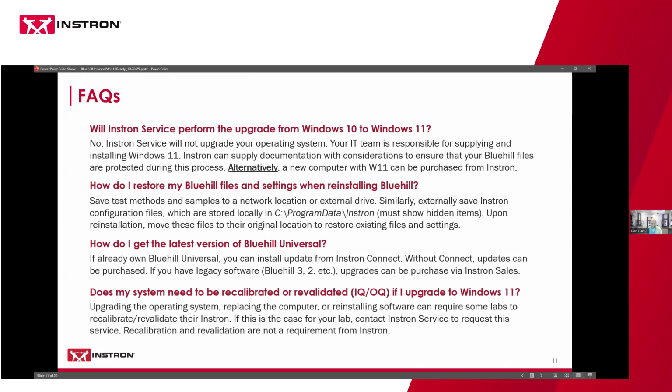that for some labs. So if that's the case for your lab, you can reach out to us to request that service. But that recalibration, that revalidation is not a requirement from Instron. It's really something that is dictated by your internal processes and quality policies.